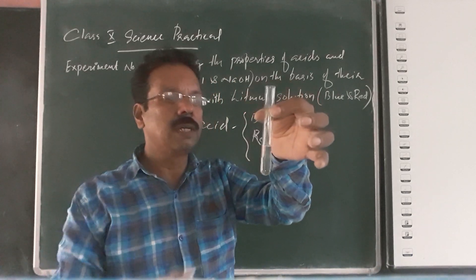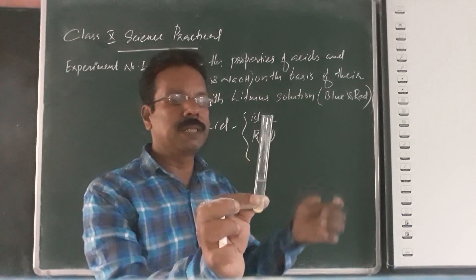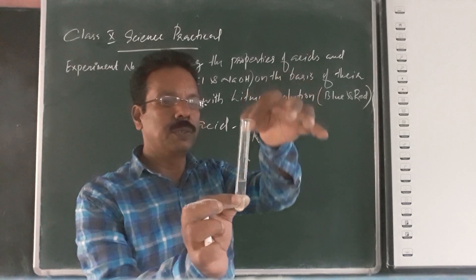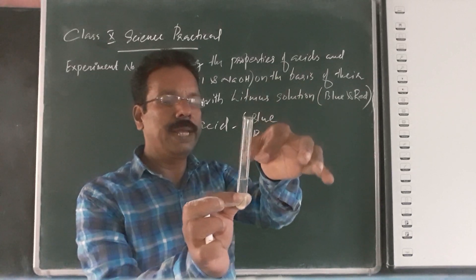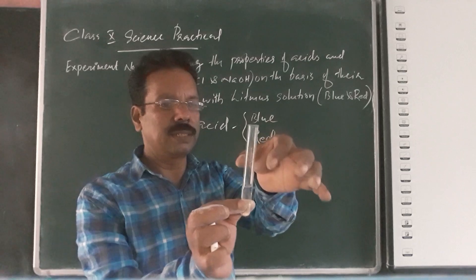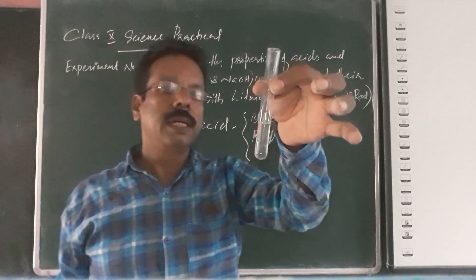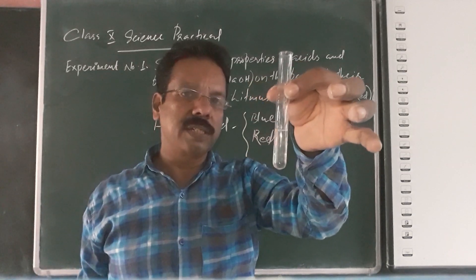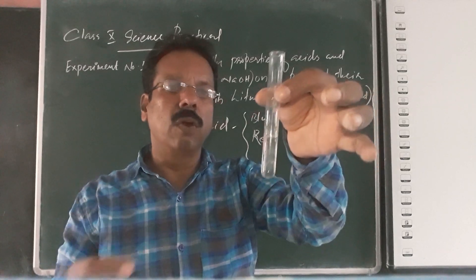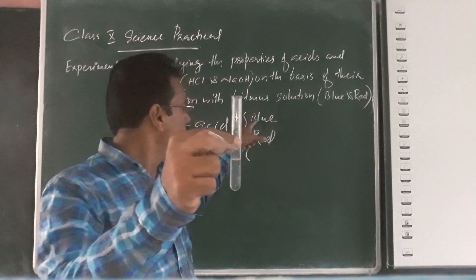First, we have to take a test tube and take water in it. After that, by using a pipette, we have to add a few drops of concentrated hydrochloric acid. Now this is a prepared hydrochloric acid solution in the test tube.